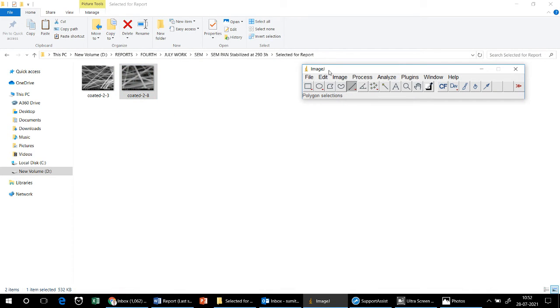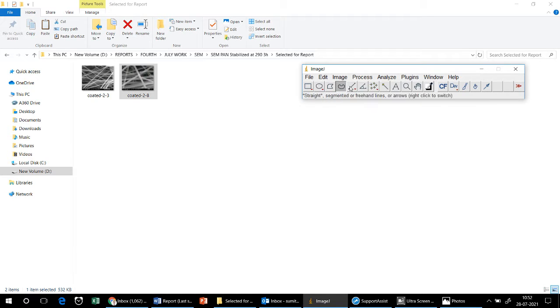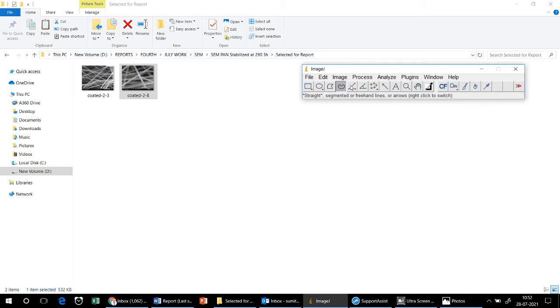Here you can see the ImageJ software. First, as you are going to measure the diameter — it is a linear scale — that's why I am selecting the straight line tool. If you want, you can select rectangle, oval, elliptical, polygon, or freehand selection, but as I am going to measure the linear scale I will use the straight line.